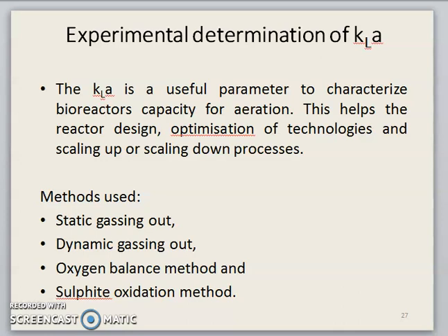The KLA is a very useful parameter to characterize the bioreactor capacity for aeration, meaning the ability and capacity of the reactor in terms of the mass transfer rate. This helps with reactor design, optimization of technologies, and scaling up or scaling down the process.